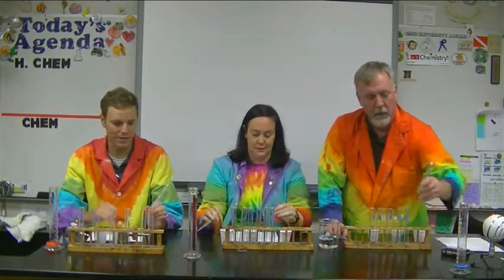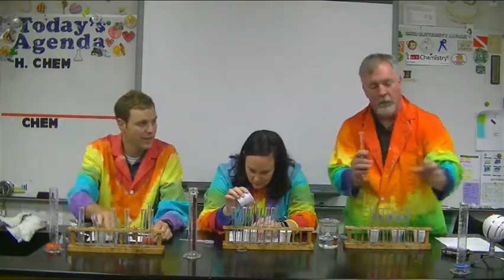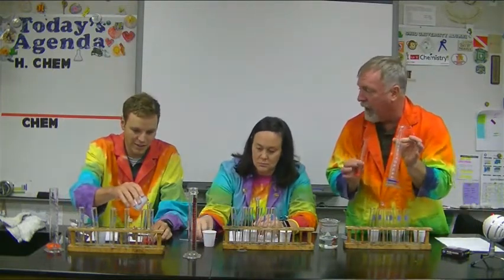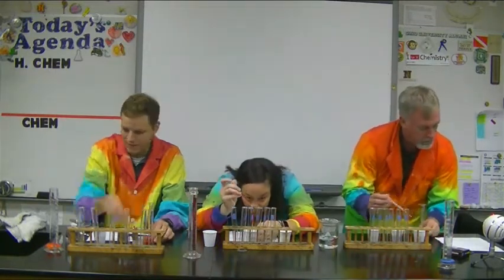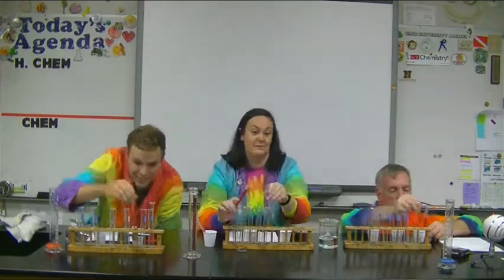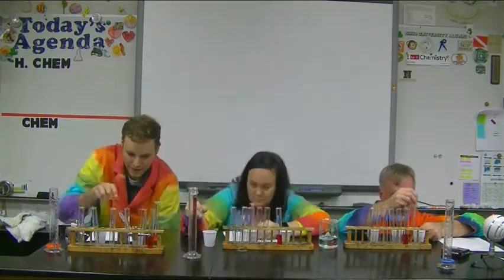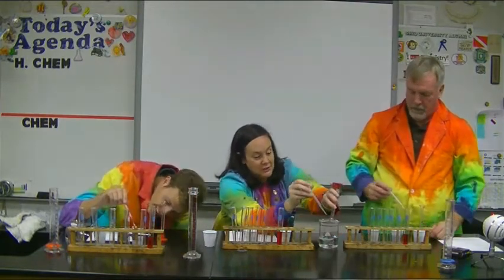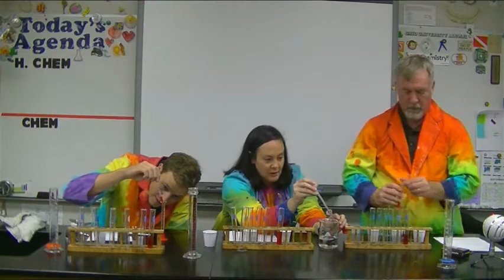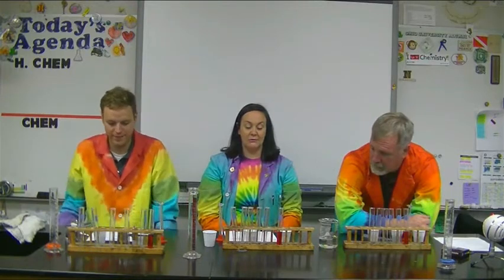Yes. Agreed. 13 is a lot closer to 10 milliliters than 100 in this big graduated cylinder. Which one of our graduated cylinders is more precise? This one. Yeah, let's use our more precise one if we can. Perfect. As always, you want to make sure you're rinsing your graduated cylinder between measurements.